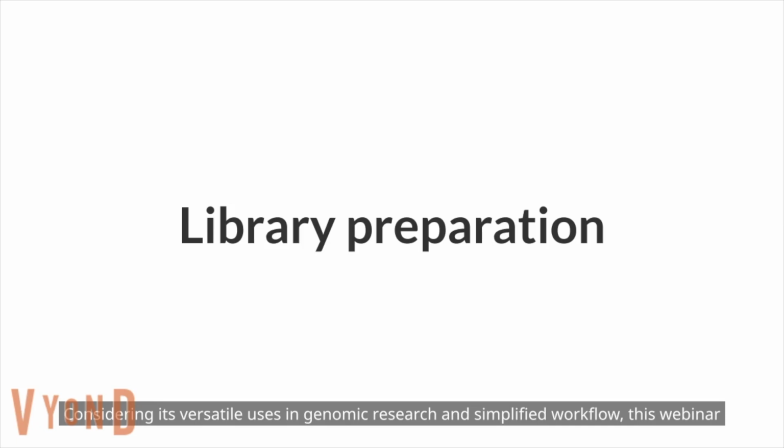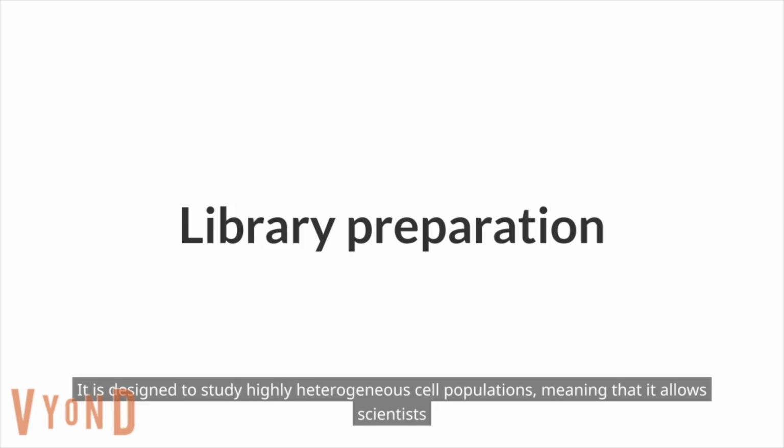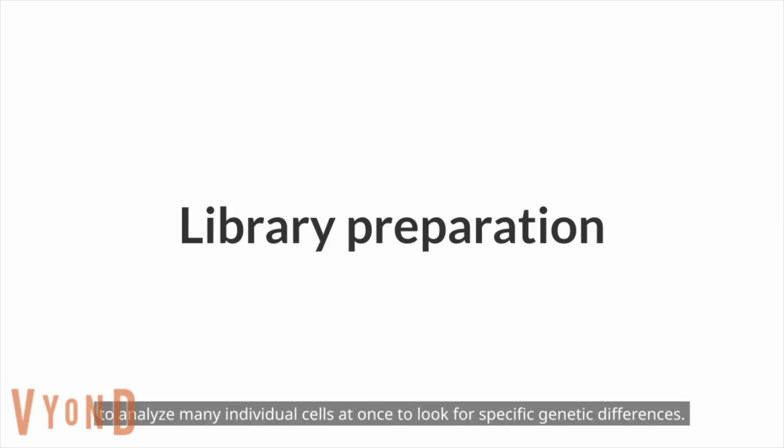Considering its versatile uses in genomic research and simplified workflow, this webinar will focus on DoTA-seq, which can be applied to both DNA and RNA sequencing. It is designed to study highly heterogeneous cell populations, meaning that it allows scientists to analyze many individual cells at once to look for specific genetic differences.